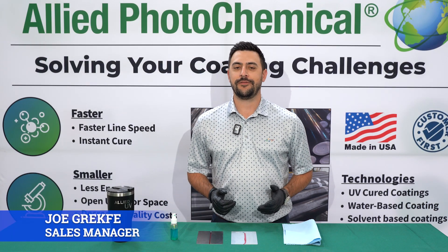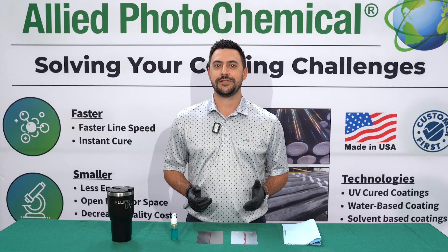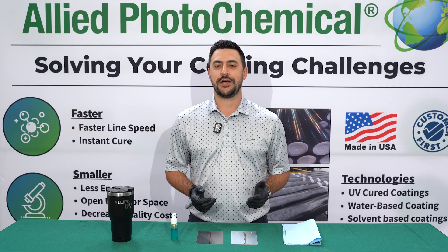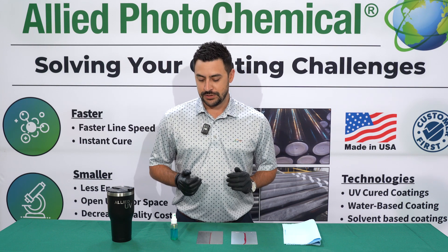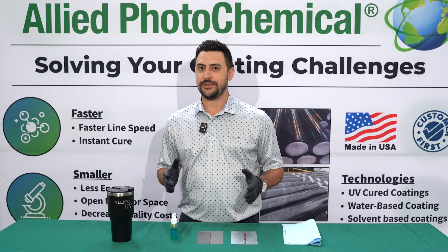Hi, I'm Joe Grafke from Allied Photochemical, back today with a quick video on how to perform a copper sulfate test to see if you have any bare spots on your coated product. This only works for metal and galvanized products — it won't work with any plastics or anything like that.